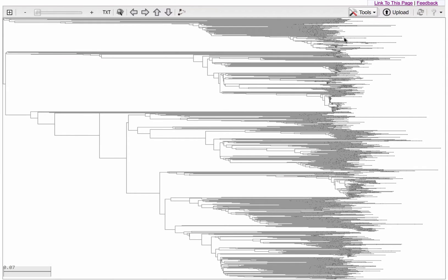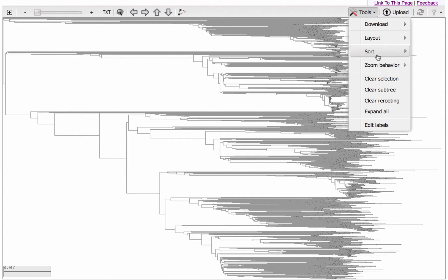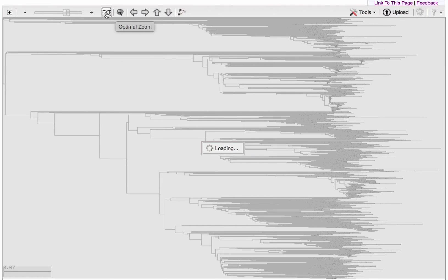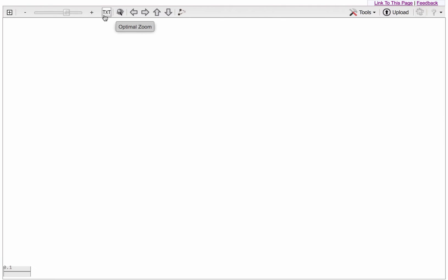And I'm also going to change the zoom behavior to Vertical, which is much better for looking at terminal node labels in this layout. To see those labels, I'll first click on Text, up here next to the Zoom slider.